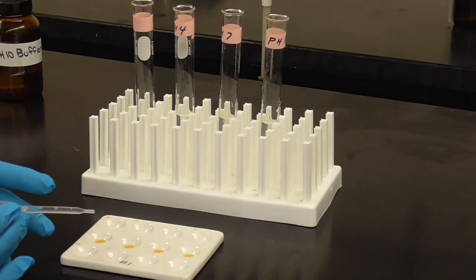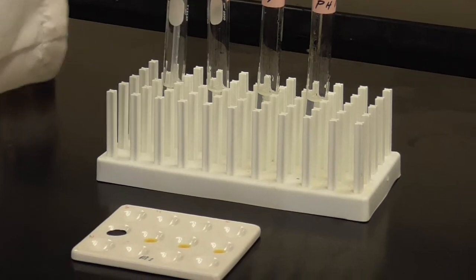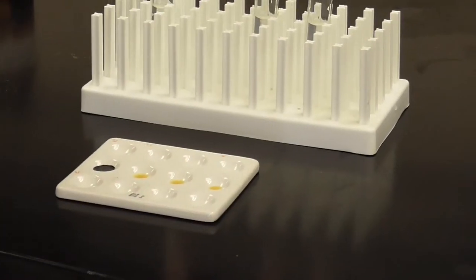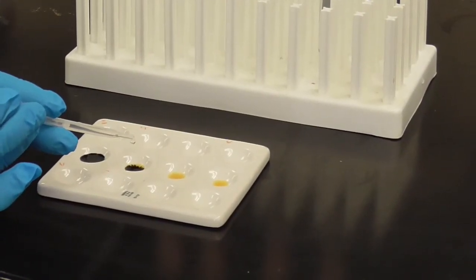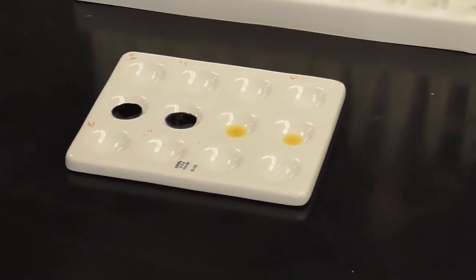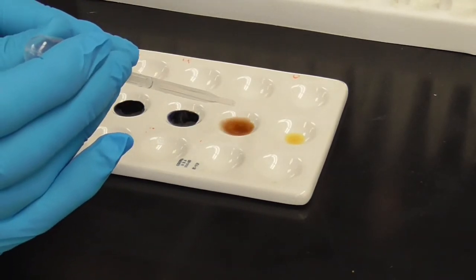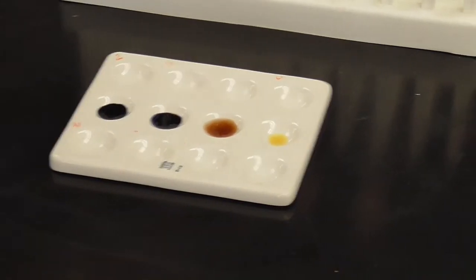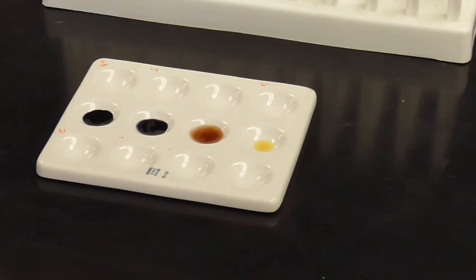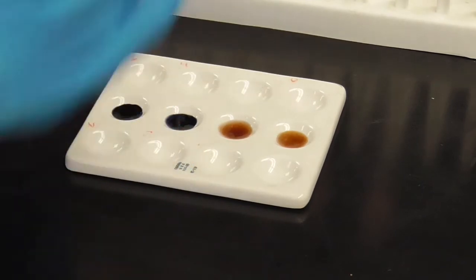Okay, pH 2. 1, 2, 3, 4 drops. pH 4. 1, 2, 3, 4. pH 7. 2, 3, 4, and pH 10. 1, 2, 3, 4.